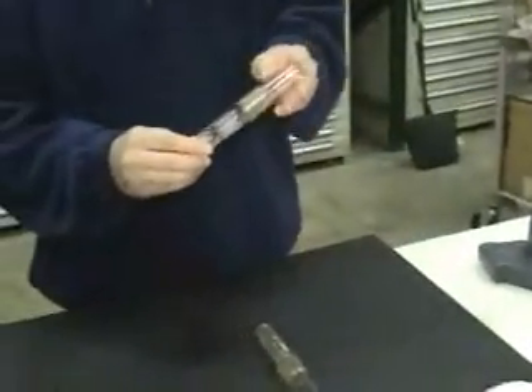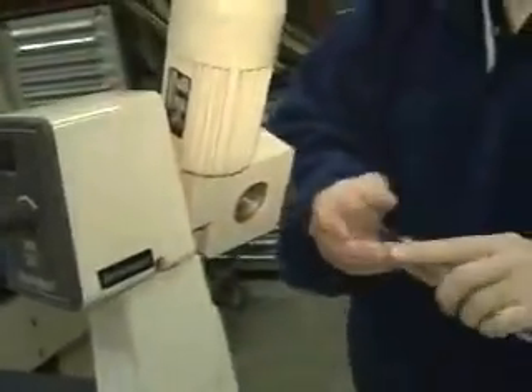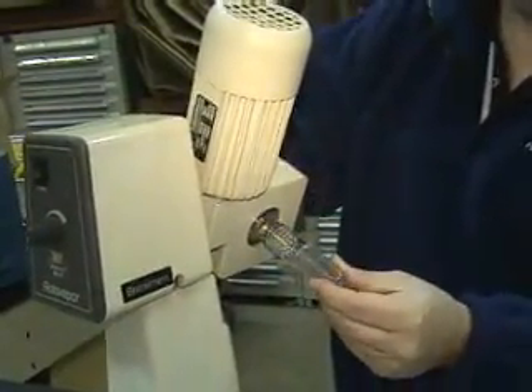Here's part number 10175 from Yuki. When you insert it, you hear a little bit of a click and it's very tight.